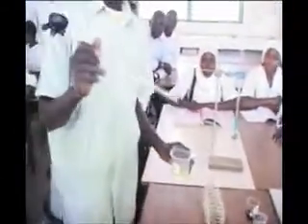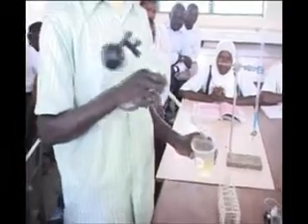Then next, we have what we call the test for protein. Now, there are three tests for protein, but we are only going to demonstrate one, and that's the Biuret test. To test for protein, we need to use this one, which is called the pipette, and we pipette 2 cubic centimeters of the mixture.